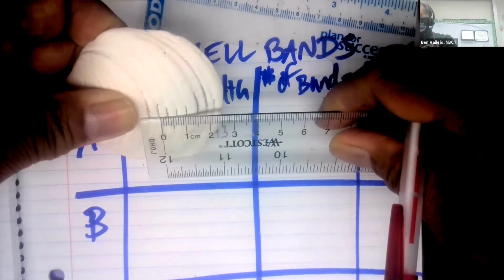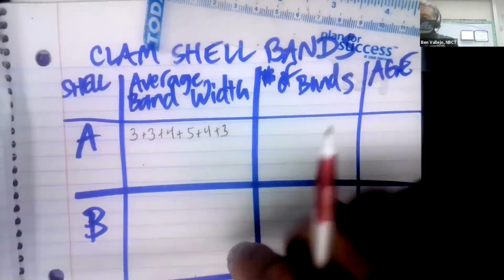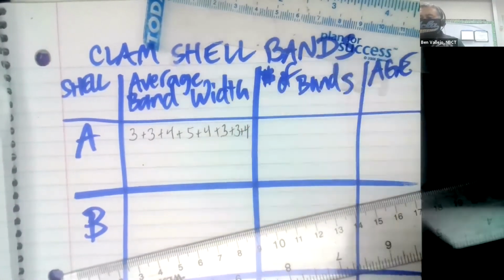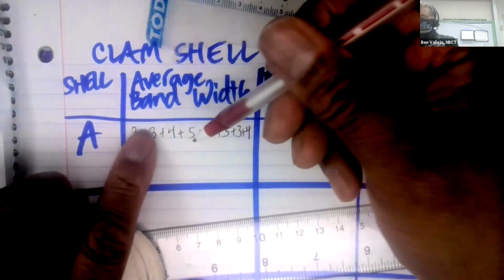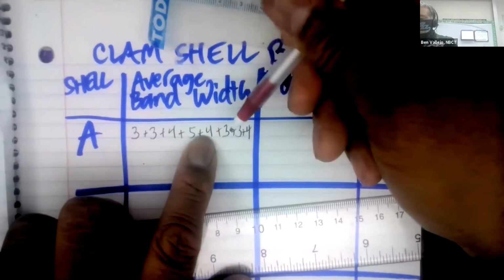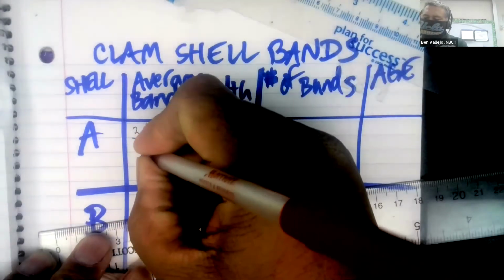And then this one looks like it's 3. So I'm going to put them in reverse order because I was going up until there. So if I add these up, that's 10 and 15. That's 19, 22, 25. It's 29.